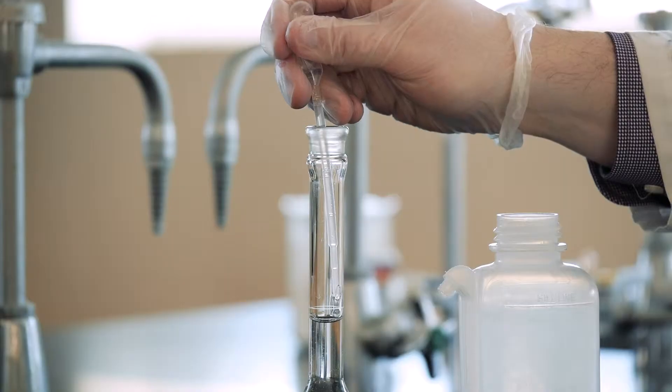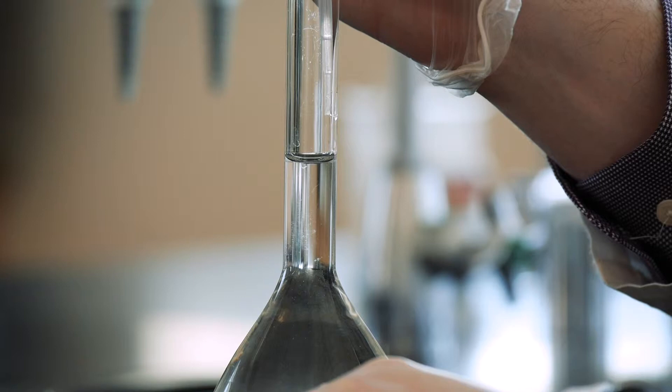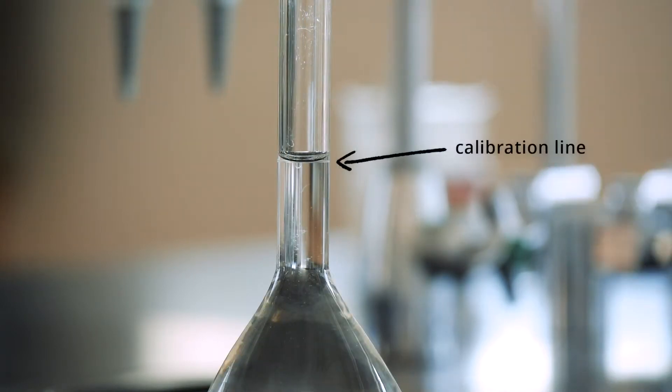As you get close to the line, start adding the water with a dropper. Fill the flask until the meniscus is resting on the line at eye level.